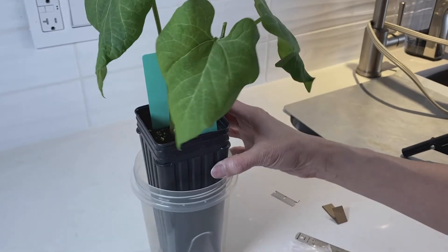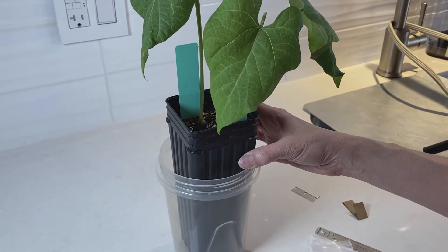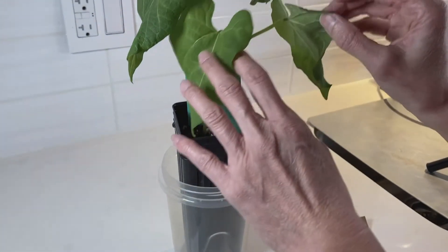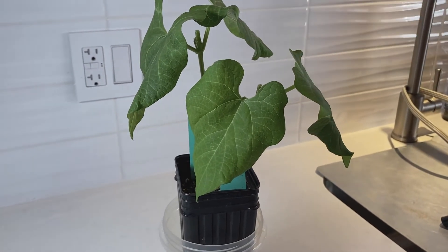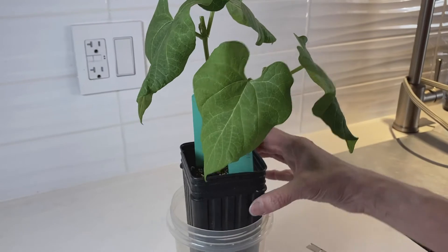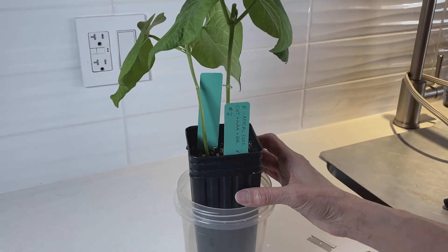You have to record your lateral bud measurements three times per week. You also want to be taking pictures. Use your little pieces of paper, write down the plant, the treatment, and the date you take the photo — that's the easiest way to keep track. Because if you don't label your photos, you're never going to remember what you did later.